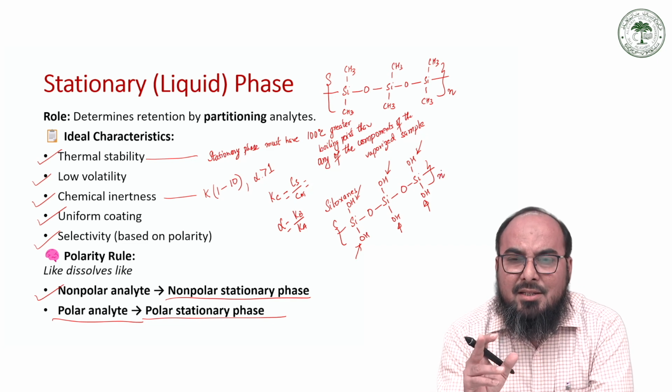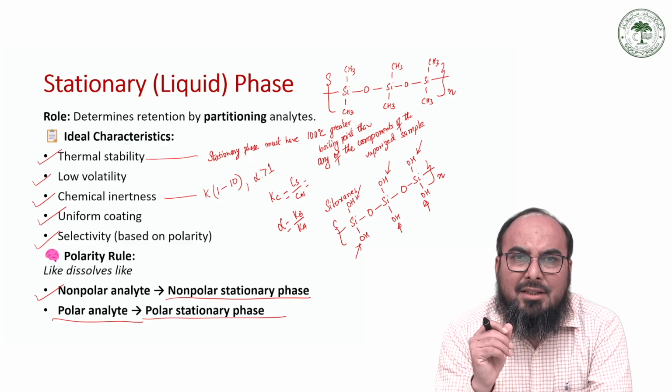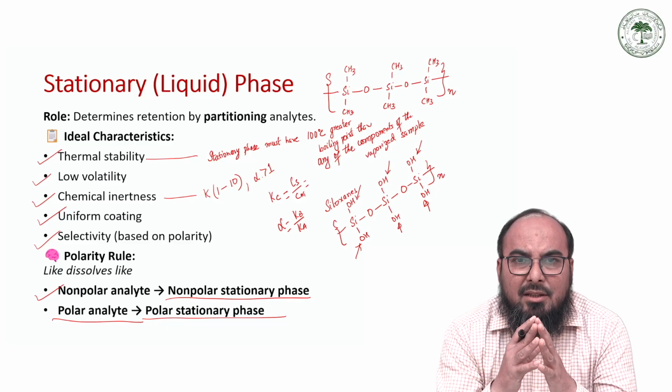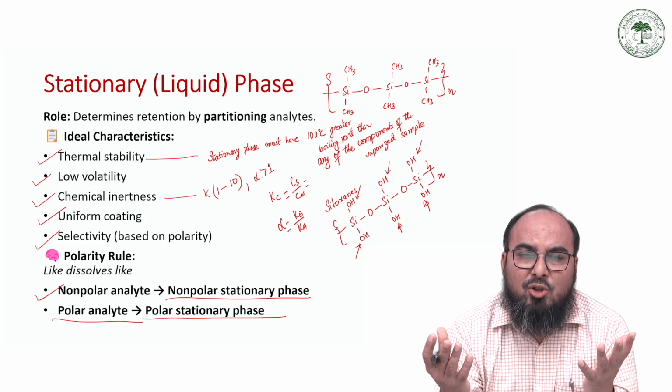Now you have replaced OH by methyl group, and this stationary phase becomes almost non-polar.